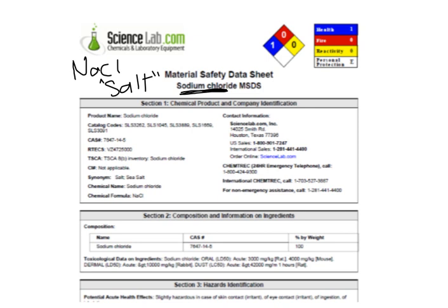So it's got all these different sections to it, and they're long. These things are boring. I would never need you to read one, but I just need you to know that they exist. Section 1, it's going to identify the chemical. Section 2, it's going to tell you some more composition. Here, can you guys see this one? Section 3, it's going to give some hazards. It's going to tell you if it's dangerous or not. Right? Salt is not dangerous.